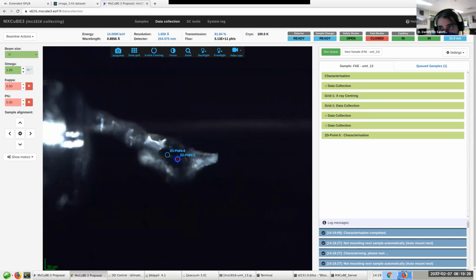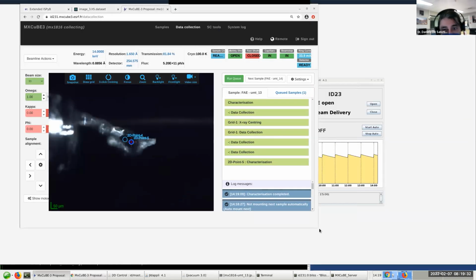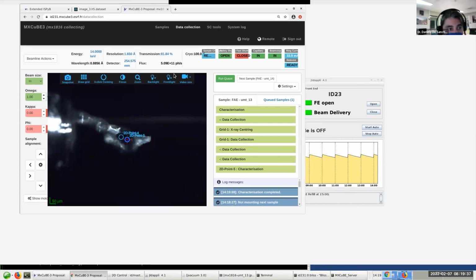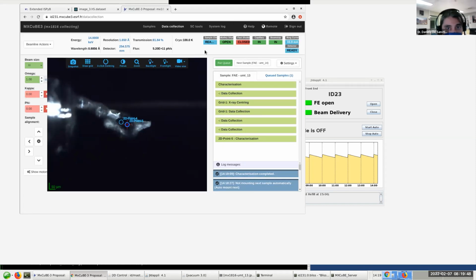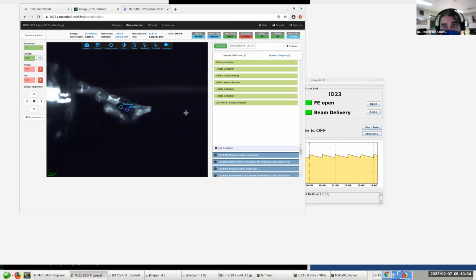However, one thing to notice is that if you have a smaller screen, as I showed you before, the window just organizes itself. You might need, as I showed you before, as in this case, to zoom out a bit. You see that it's a bit small, but it still works okay.